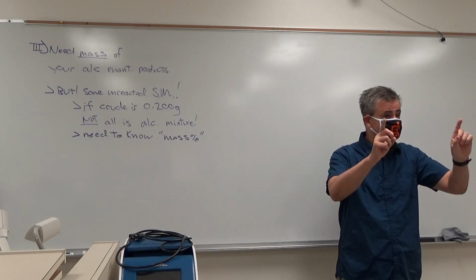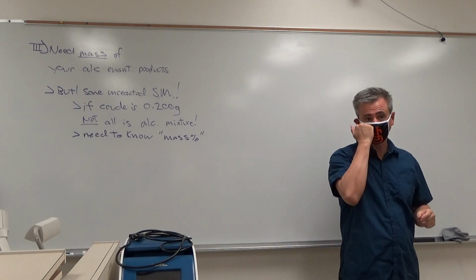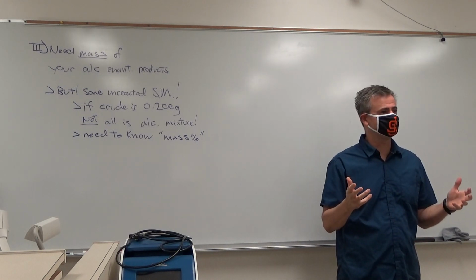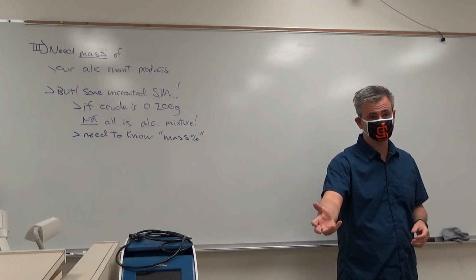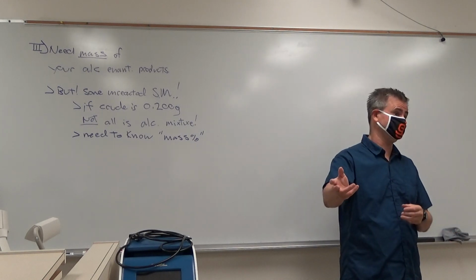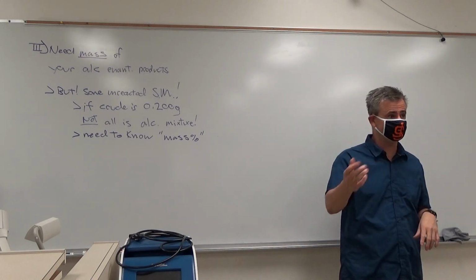By the way, it's important when you're picking two signals. Oh, I'm going to pick that signal. I'm going to pick that signal. It's important. Pick a signal that's worth the same number of protons on the molecules. What I mean by that is, if you're using a methyl on your starting material, use a methyl on your product. If you're using a CH2 on your starting material, because that'll throw it off, right? You can do the math if you want to compare a methyl.